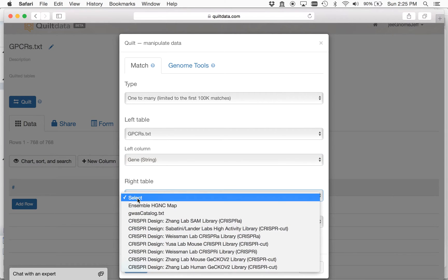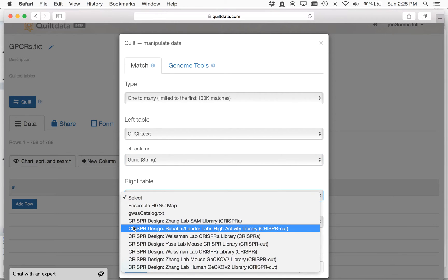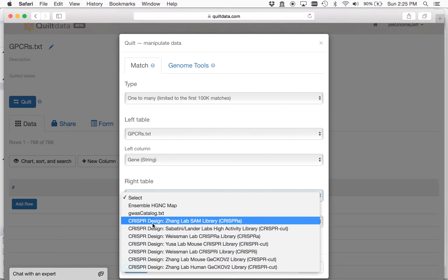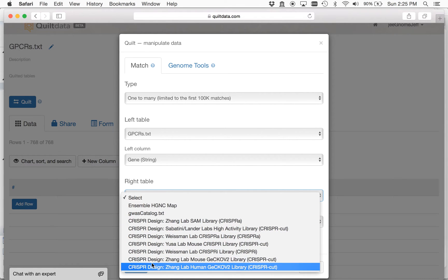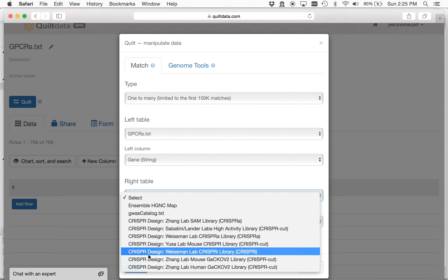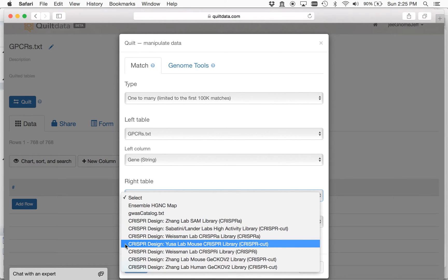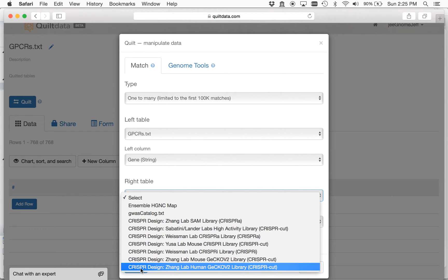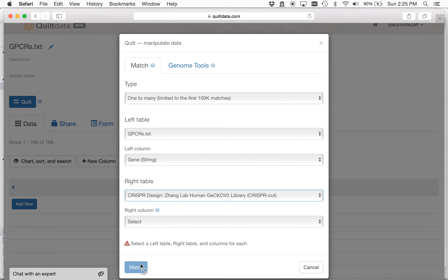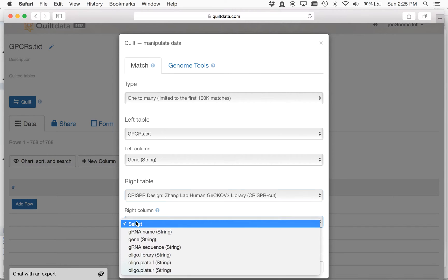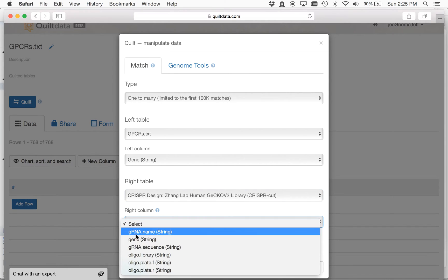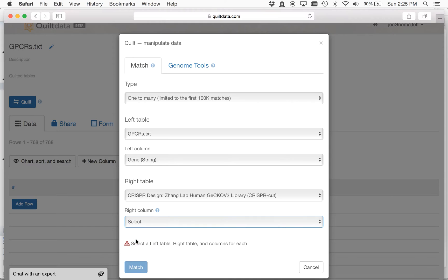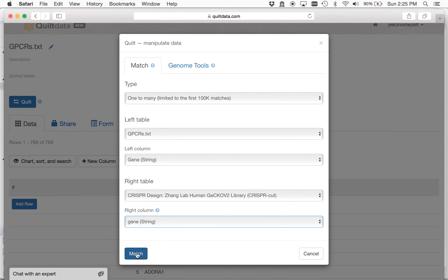And in this right table, there are a number of publicly available CRISPR design tables that are derived from genome-wide screens that have been published and are in the literature. And for my purposes, I'm going to use Feng Zhang's lab's gecko library that utilizes a cutting CRISPR for all the genes in the human genome, and I'm going to match here on the Gene column. So I'll hit Match.